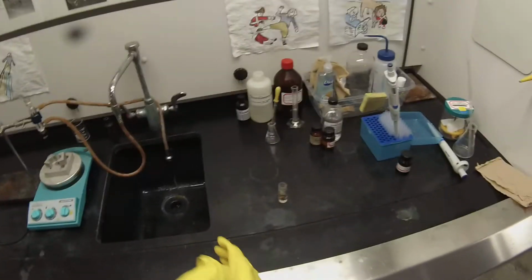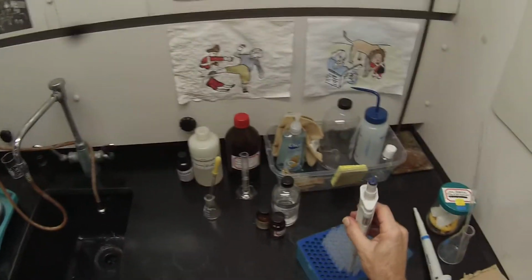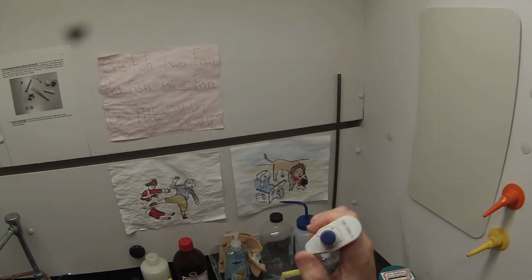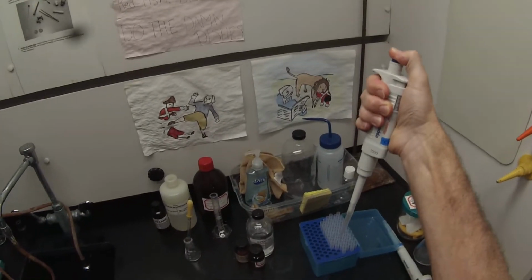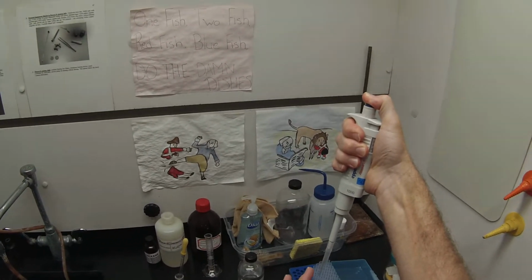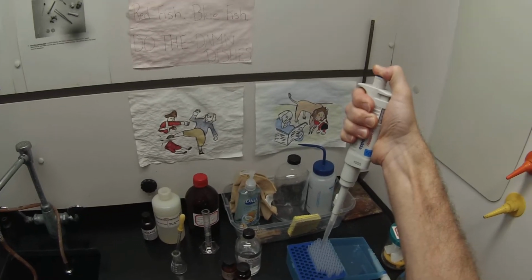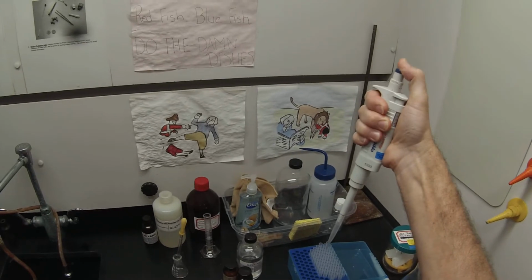And at this point, I think I'll dispense with the gloves. So we need 913 microliters of n-butanol, and if you're not familiar with these auto pipetters, there's the first time it hits, right? That's where you want to go to fill it, and then there's a second little one where you can press it a little harder, and that'll get the last piece out.